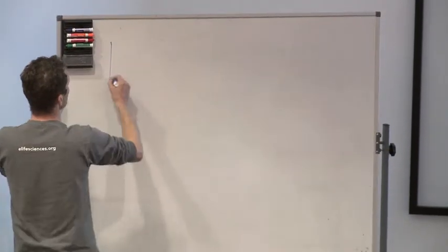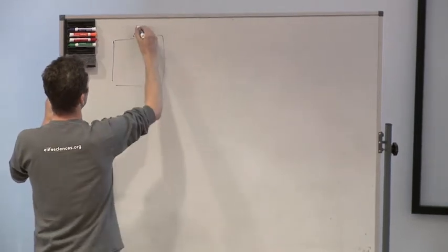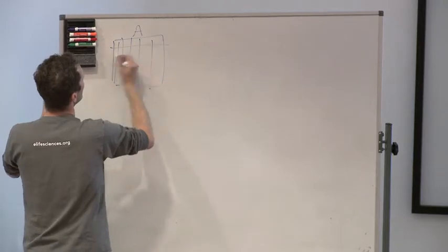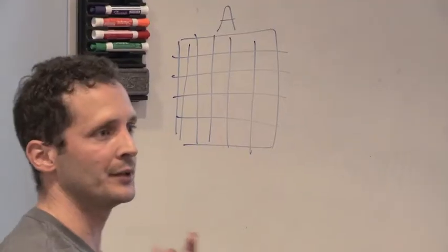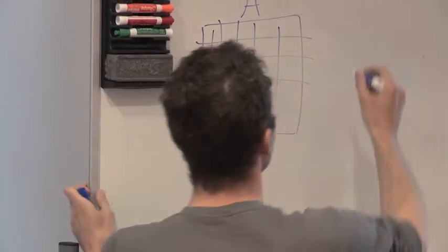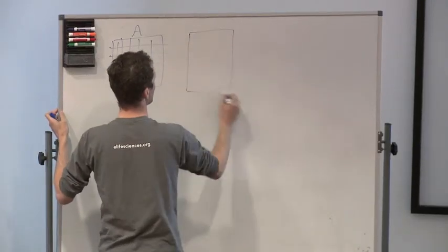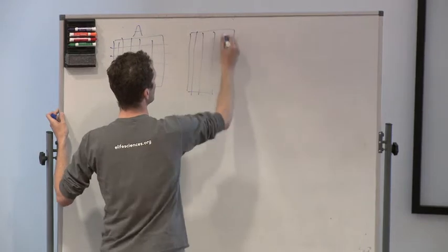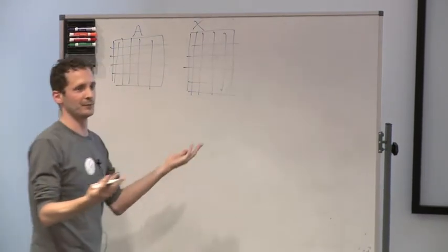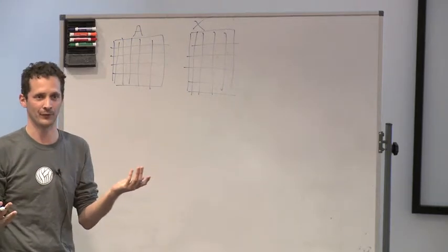the first image A, which could be our reference image, is just a two-dimensional array of pixel values, and the whiter it is, the larger the value, for example, and the blacker the smaller. And we have image X there as well, which is a similar array of pixels, and the values in that image are just different, okay?